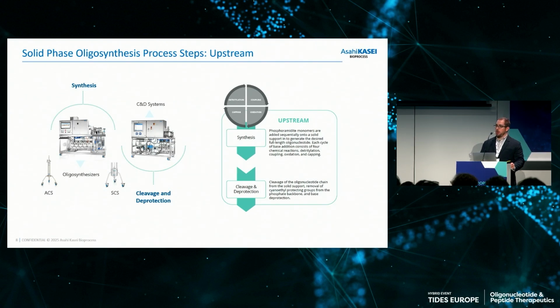Now, there's obviously other approaches that are in development with very promising and varying levels of progress, and will be, I hope, available in the future for a variety of commercial products. But today, far and away the most popular and most prevalent approach for synthesis is the flow-through solid phase synthesis, and that's what my process steps and the equipment that I'm talking about today will be related to.